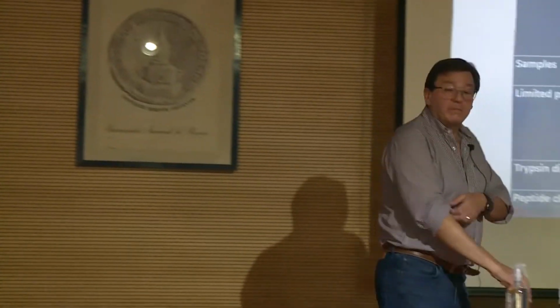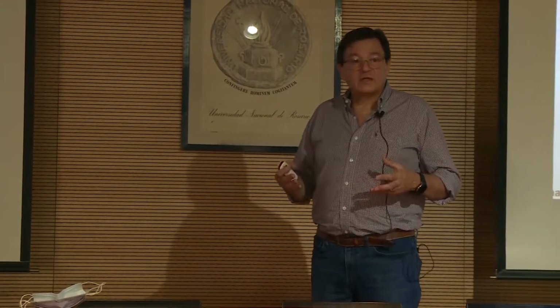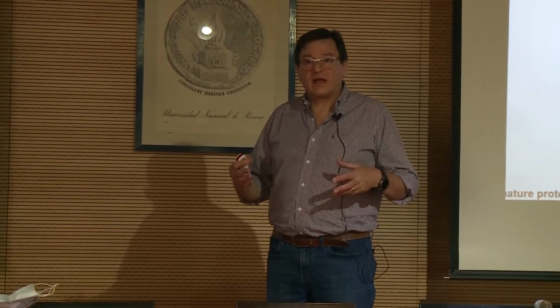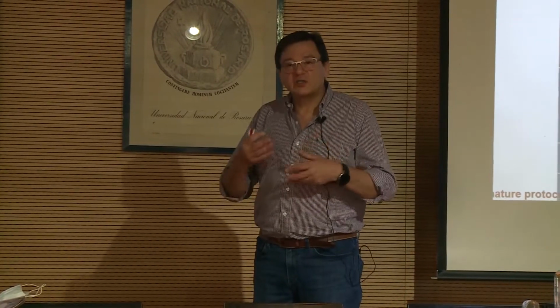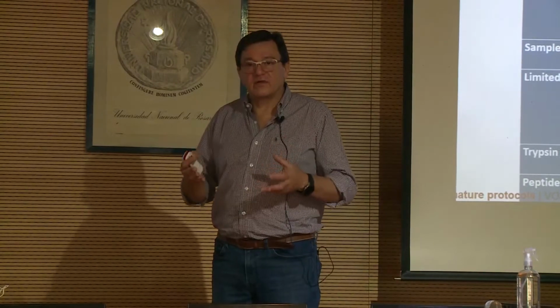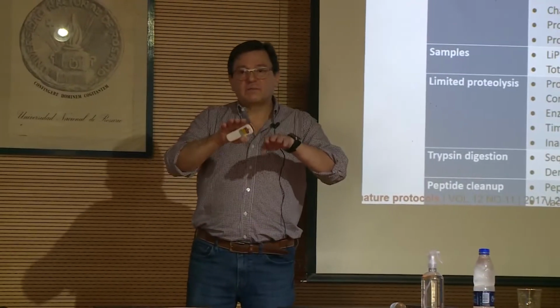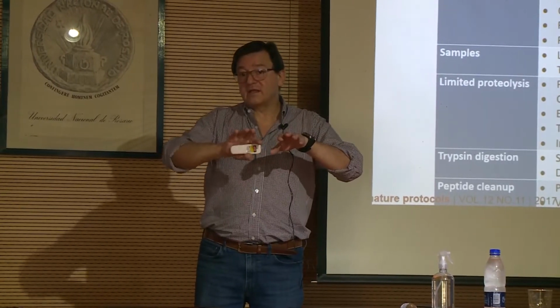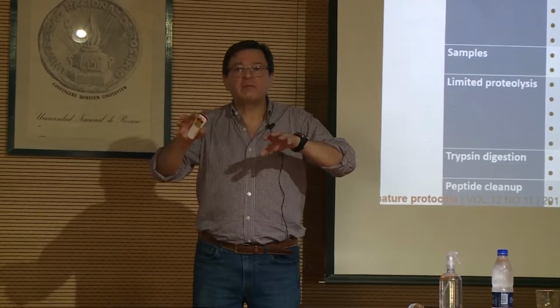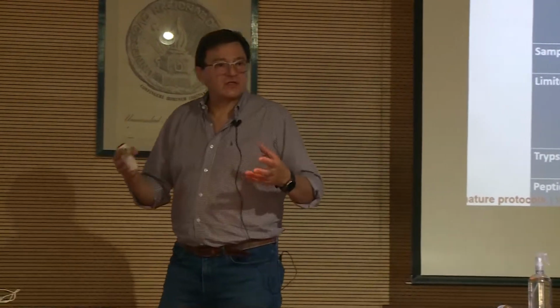This is a problem because you have to be sure that the buffers that you are using and your pH and your ionic force are not disrupting too much the interactions of your extract. It always will happen. So it's better to think that this is a methodology that will not replace others but will complement other methodologies to search for interactions.